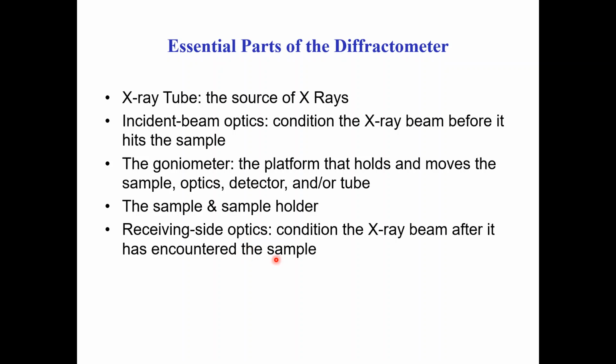Here we have two types of optics. One is the incident beam optics, and the other is the receiving side optics.